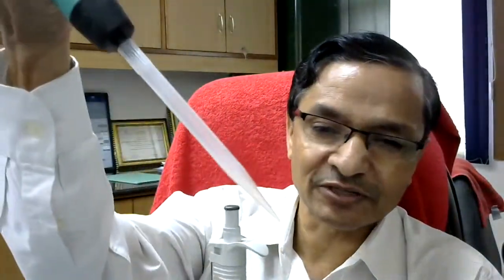Of course, you can also use glass pipettes and do that experiment using them. For this 5 ml pipette, if you have to take 5 ml, see the tip size: bigger tips will be there, and you can put them like this. You can adjust the reading and take that.